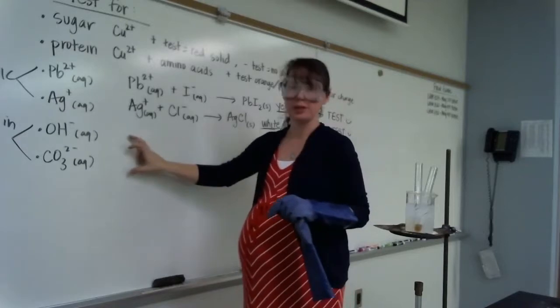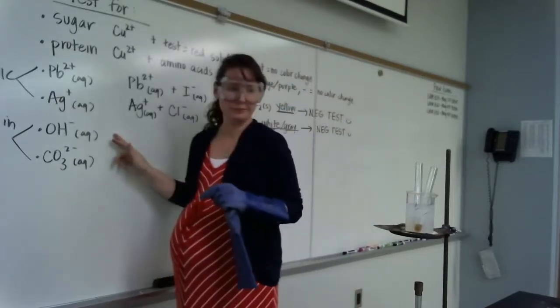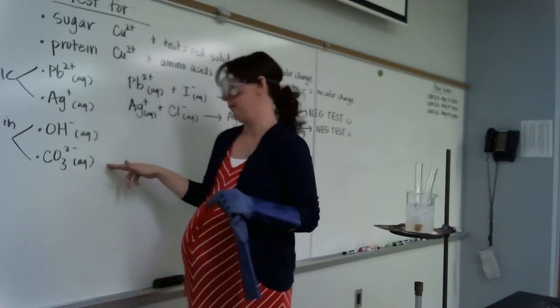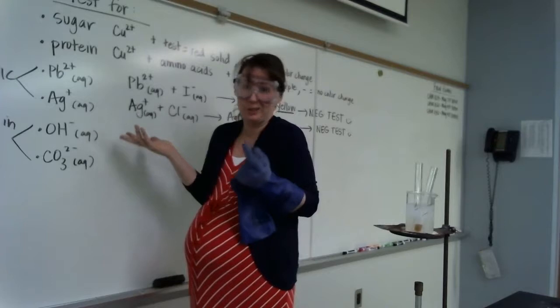Now let's test for these two. These are safe in low concentrations. Hydroxide ion is present in a lot of places, right? And carbonate, if you have hard water, you've got carbonate. So both of these, if you've got it, it's no big deal.